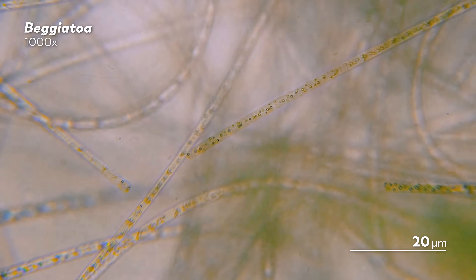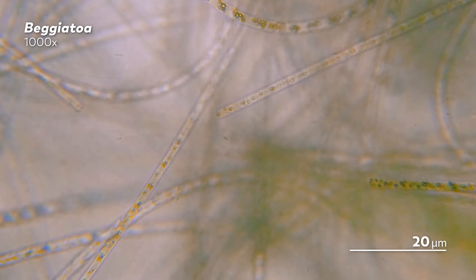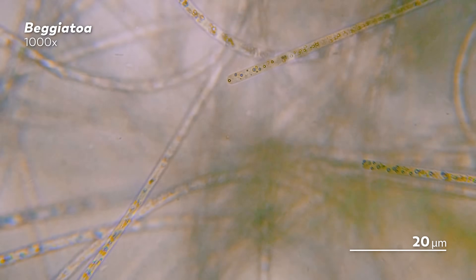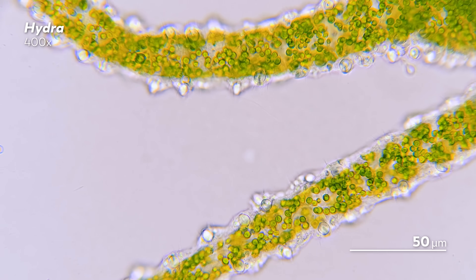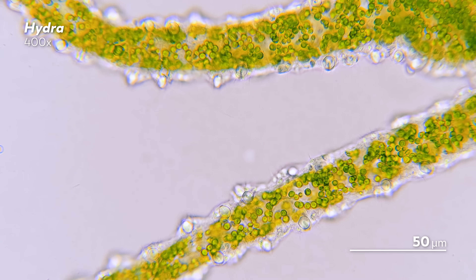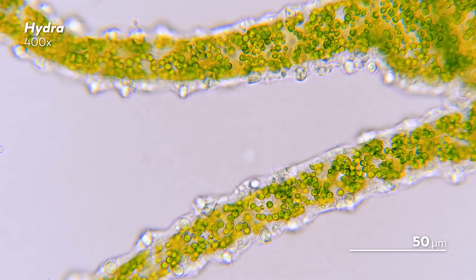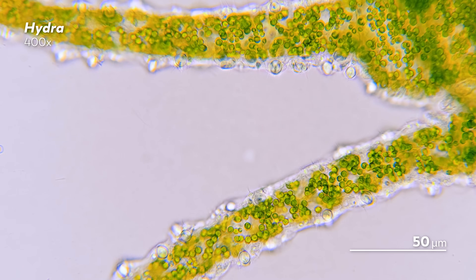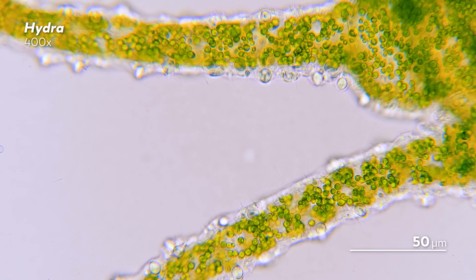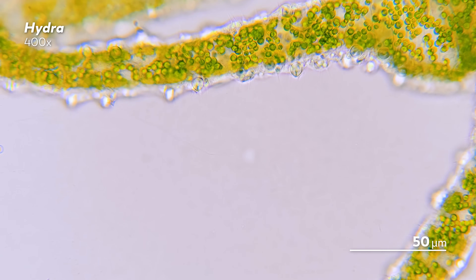The first few times you might be tempted to add maybe a little too much water to the slide, especially because it seems a little improbable that you will find something in a small droplet of water. But microbes are tiny, and so you probably will find something. And too much water will cause the light to refract, which will make it difficult to make out all the spectacular details lying within their bodies. So you'll want to try and keep the sample as thin as possible.